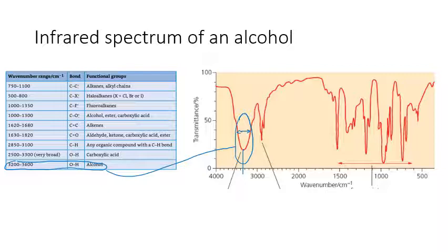Let's also have a look at this little peak here. This little peak is about 2,900.